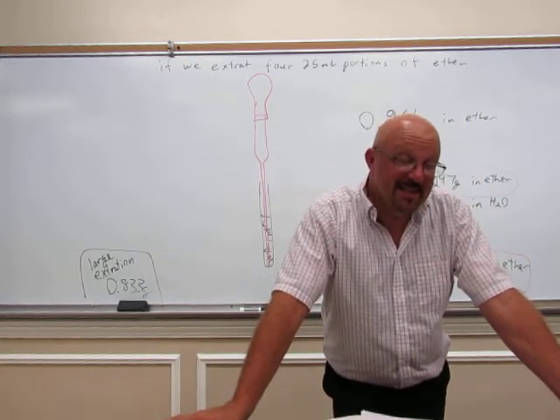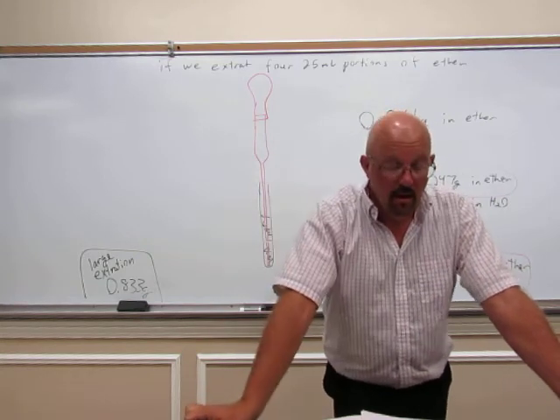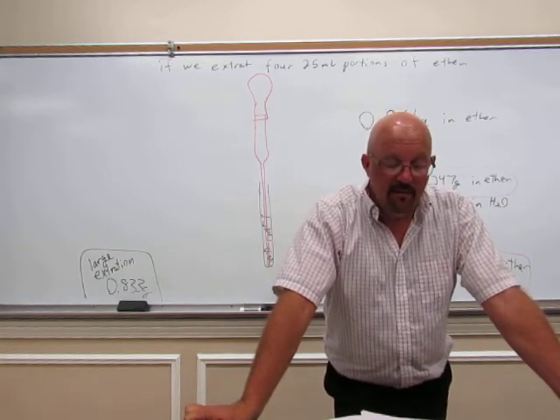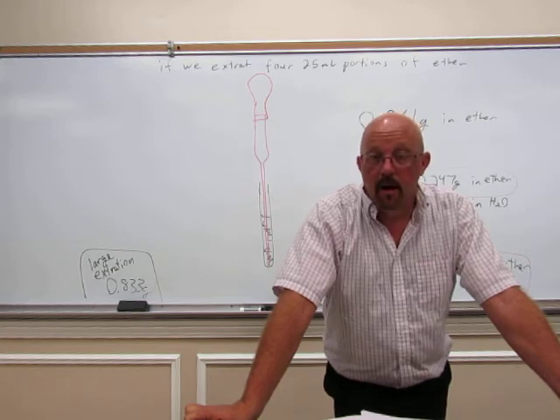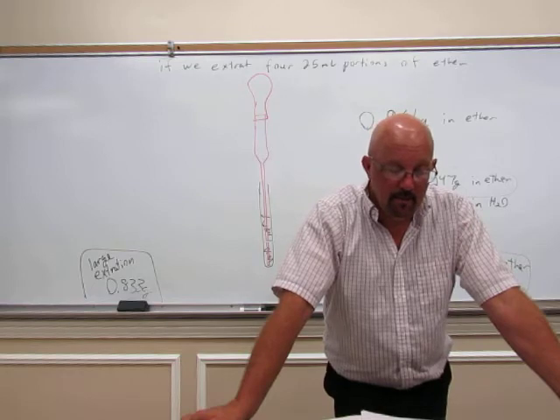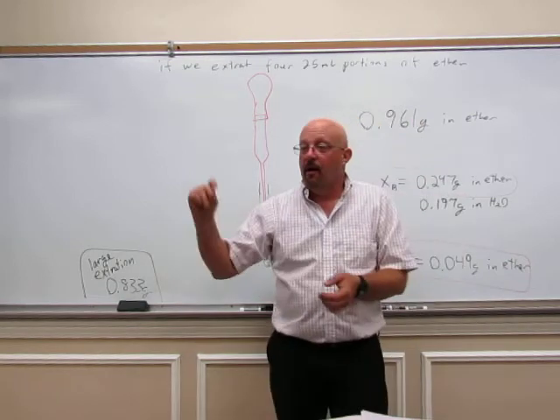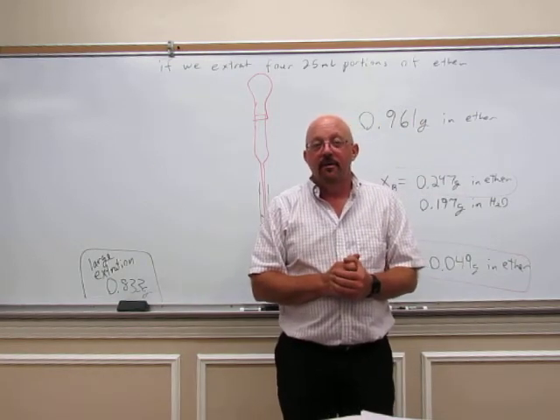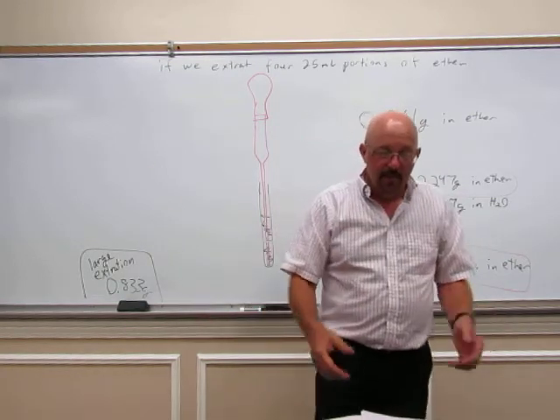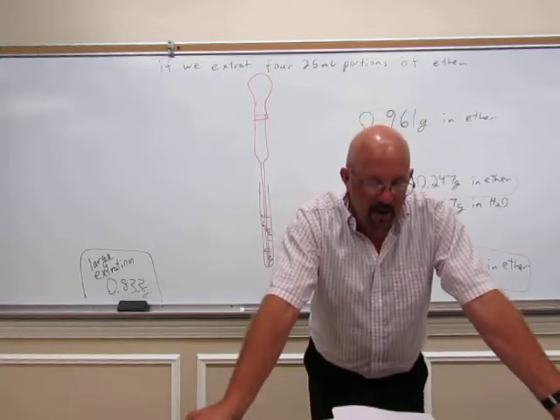So it takes some time to dry. This is not instant. Give it at least 5 minutes to fully dry before you proceed. Give it at least 5 minutes of drying time. You wash your clothes and put them in the dryer. They're not dry in 2 seconds, are they? Takes some time. Same thing here in the lab. Takes some time to dry. So give it some time.